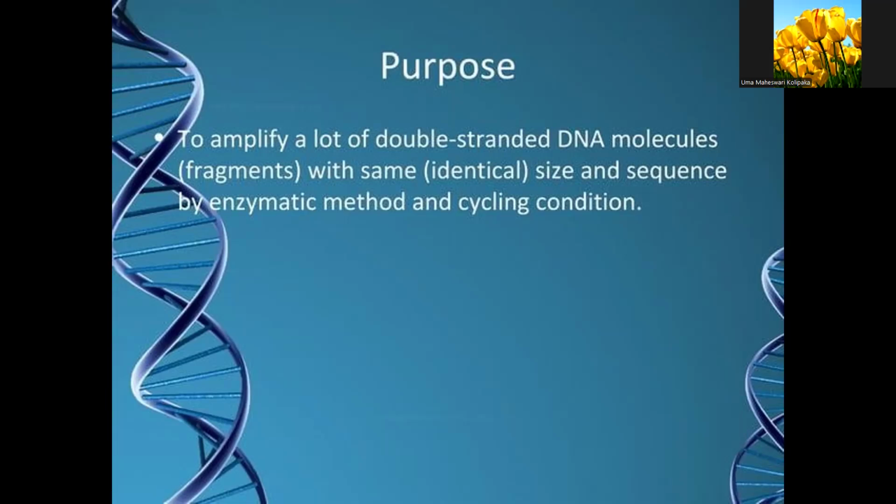So we can conclude the purpose of PCR is just to amplify, just to multiply a small double-stranded DNA fragment into n number of copies. That is the basic purpose of PCR. We do this with the help of cycling conditions and by using various enzymes.